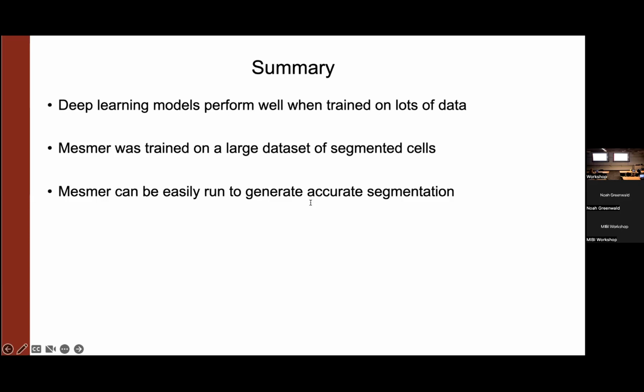If I performed not ideal background subtraction, will Mesmer segment some noise as cells? That's a great question. If it really does look just like noise, Mesmer is not going to be super influenced by that. If it's autofluorescence or noodles or something that has more of a structure to it, and you didn't know where it came from, you'd say that could be a cell. Mesmer is going to say that could be a cell. So that's kind of the gut check. If you had to know by looking at some other data source that actually this isn't a real cell and it's something else, Mesmer's not going to have access to that, so it's just going to assume it's a cell. So it really depends on what the source of noise is in your data.